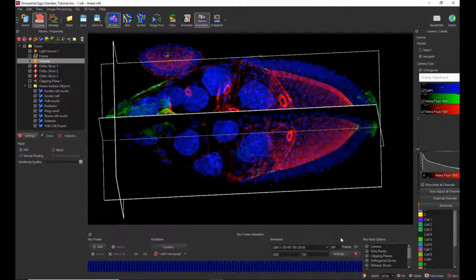So you just multiply the number of keyframes by 24, and that's your ballpark figure of the number of output frames to make the video play smoothly. But for the preview, I just keep the 100 frames for now.